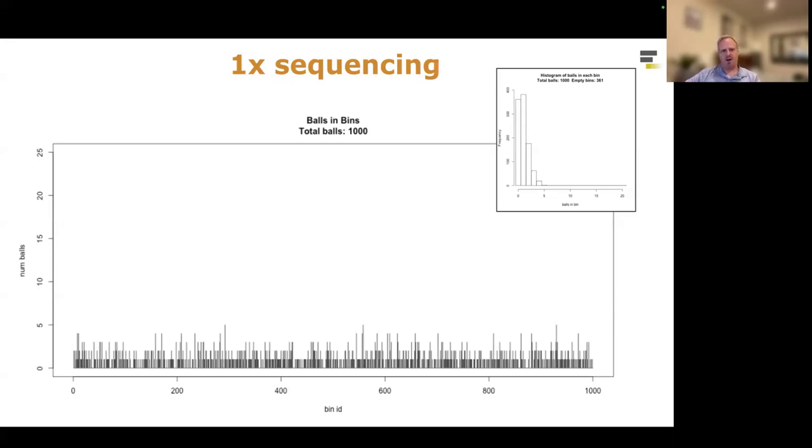This is one of these hard statistical facts. And the reason for that is about a third will have no coverage, about a third will have 1x coverage, and about a third of your genome will have more than 1x coverage. And that effectively steals away coverage from other places. And that creates all those coverage holes where you have just sort of 0 reads present there. So having 1x coverage of a genome is just not enough. You'll be missing about a third of it. The human genome is about 3 gigabases long, so you'll be missing about 1 gigabase out of that assembly. In reality, you may even be missing more than that if all you've done is collected 1x sequencing.